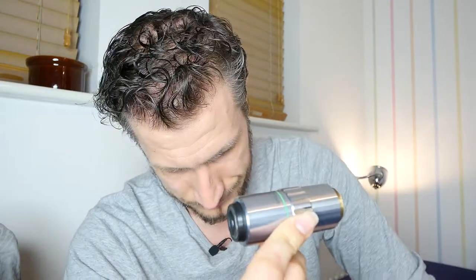So I had a look at the lens, found out there was a problem with delamination, and sent a message to the guy. I said, sorry mate, I want to return the lens because it has this kind of damage. He said, I'm very sorry about that, I can maybe give you a partial refund. I said, all right, fair enough. I'm able to take it for 150. That's my maximum offer for the lens. Otherwise, I'll send the objective back. He gave me another counter offer. I said, sorry mate, give me your address and I'll send the lens back. So he agreed to 155.